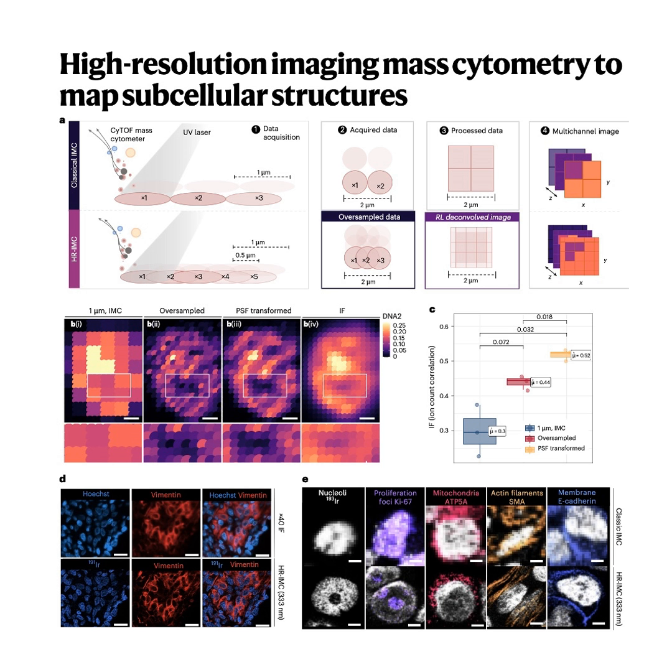Our source material today details a really foundational breakthrough, not just in biology, but in computational imaging. And it's all centered on a tool called imaging mass cytometry, or IMC, right. And what makes IMC such a game changer is its ability to track dozens of proteins at once, a really high level of multiplexing. It does this using antibodies tagged with heavy metal isotopes, which are then detected by mass spectrometry.